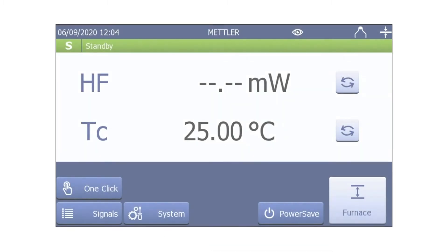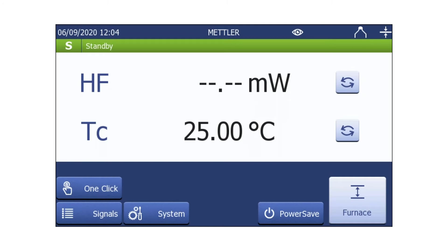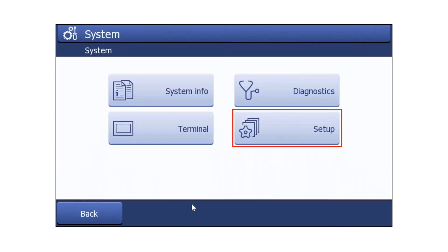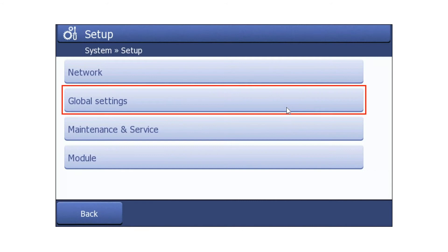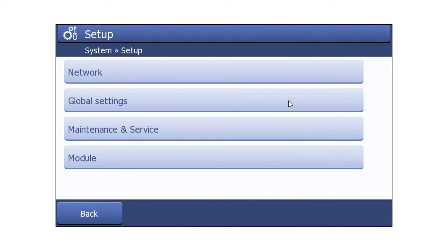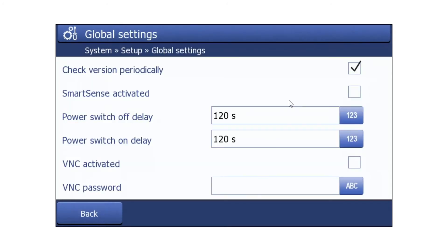Once the VNC viewer is successfully installed on your smartphone, go to the terminal screen of your instrument and select System, then Setup, then Global Settings. Under Global Settings, activate VNC by checking the relevant box, as shown here.